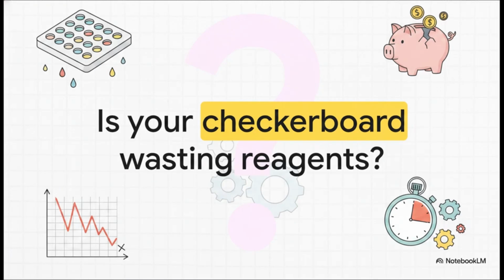Is your checkerboard titration wasting precious reagents? I mean, think about it for a second. If you work at the bench, the checkerboard titration is probably one of the very first things you were ever trained to do. It feels safe, it's reliable, and it's super familiar. But what if the very tool you trust the most to optimize your assays is actually costing your lab time, money, and accuracy? Today, we're unpacking exactly why this happens, the hidden limitations of the tools we use every single day, and most importantly, what you can do to fix it.